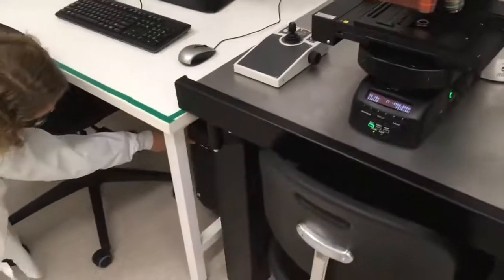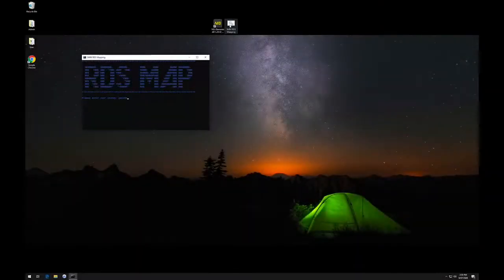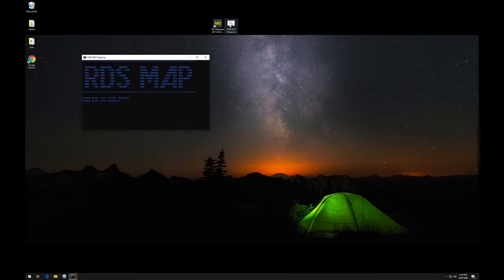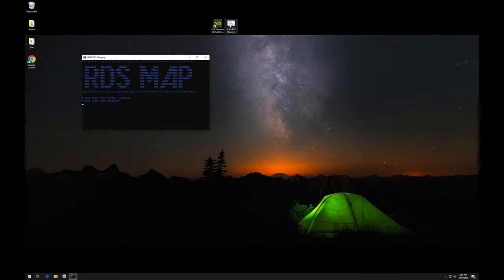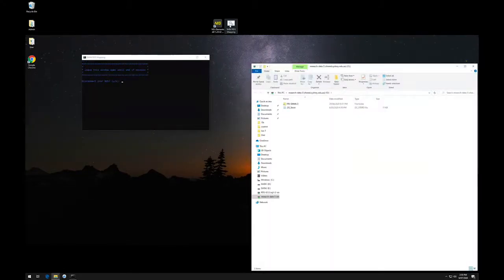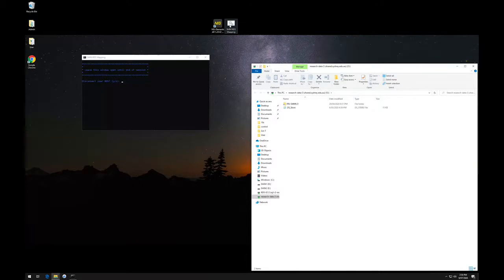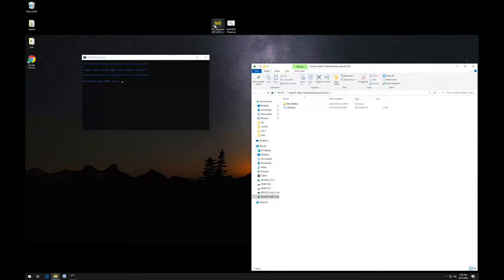Next, turn on the computer. Once the computer boots up, connect to your research data store using the RDS icon and enter your Unikey and password. If you incorrectly type your credentials, close and reopen the icon to start over. Leave this software open so you remember to log out of your RDS at the end of your session.